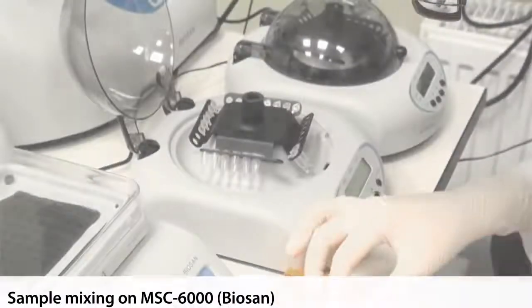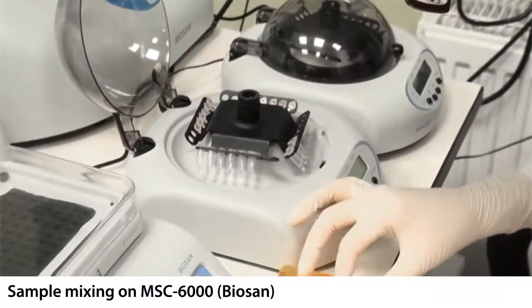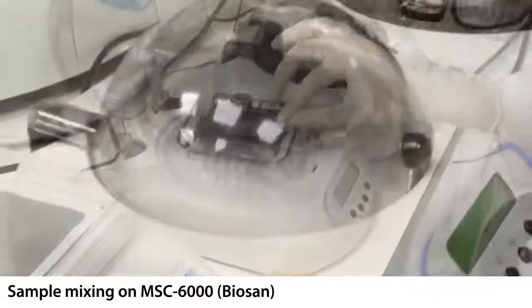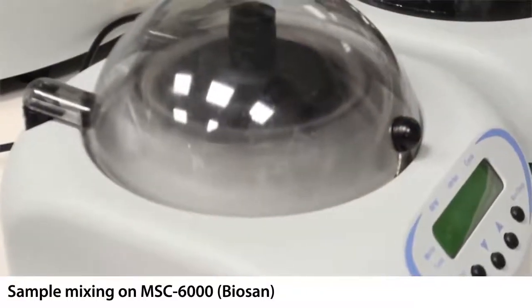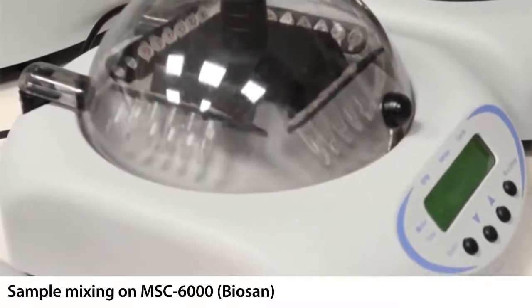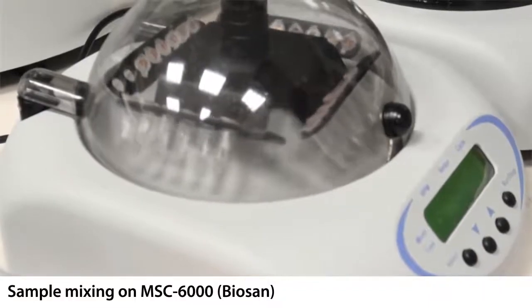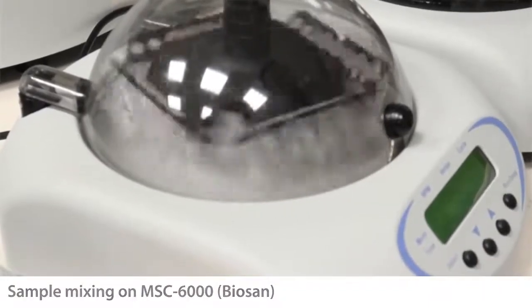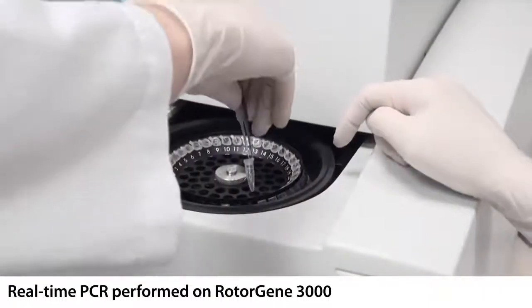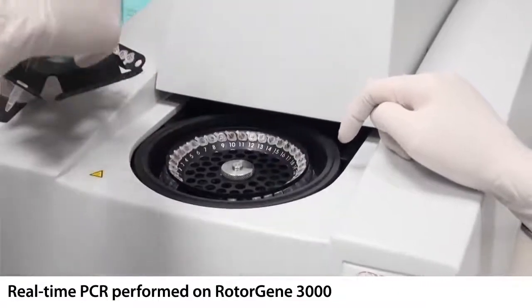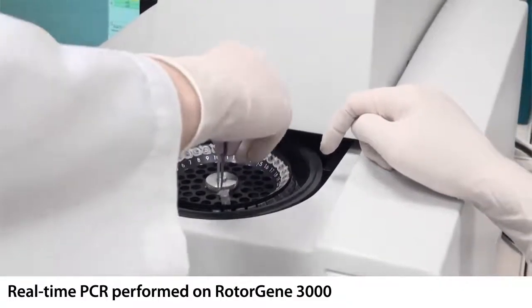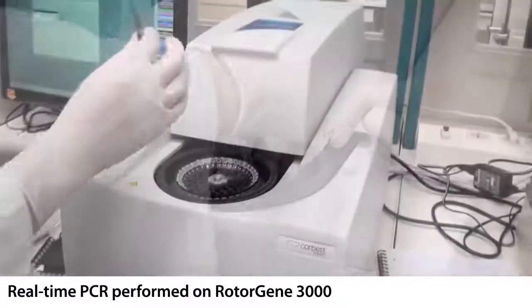Phage lambda copy numbers were detected by real-time PCR. Reagents for real-time PCR were provided by Central Research Institute of Epidemiology from Moscow, Russia.